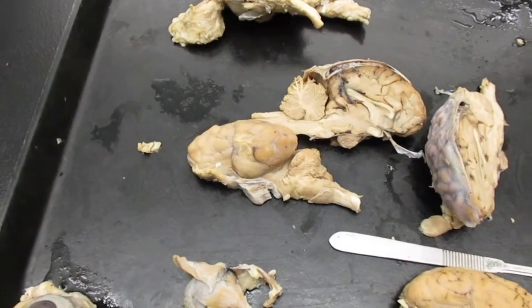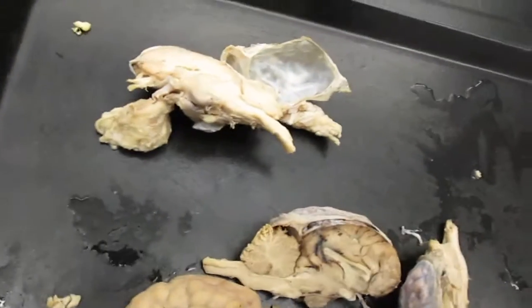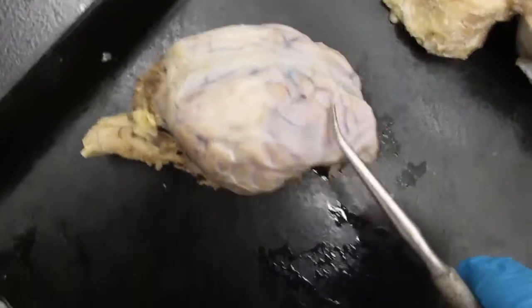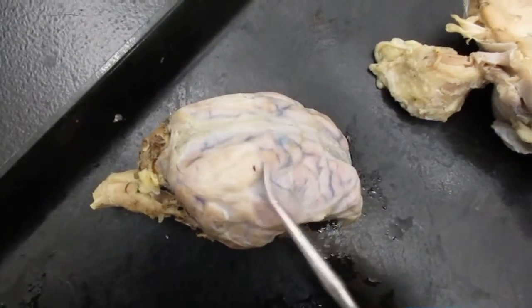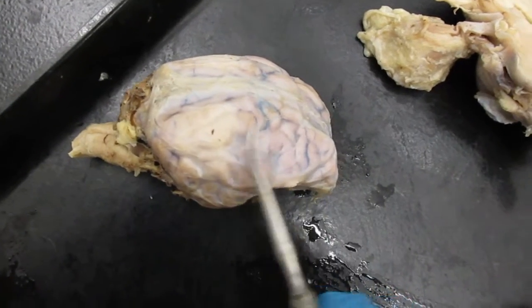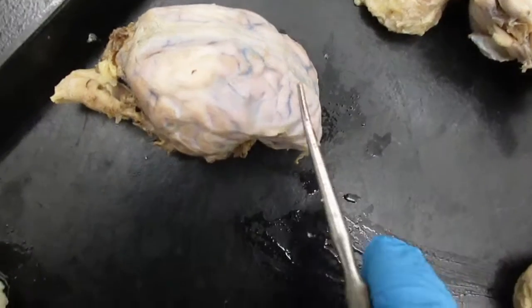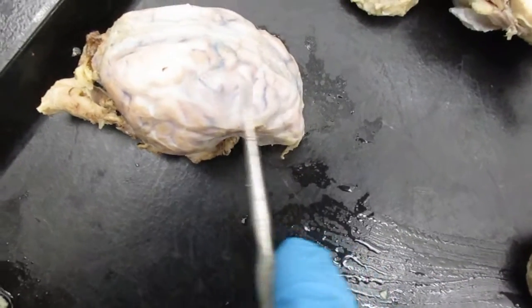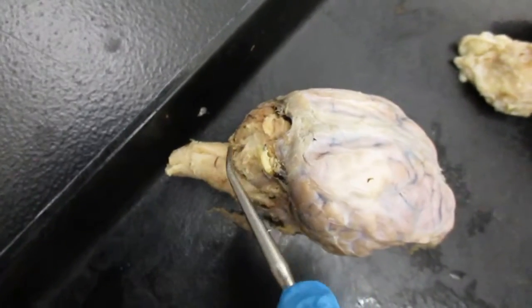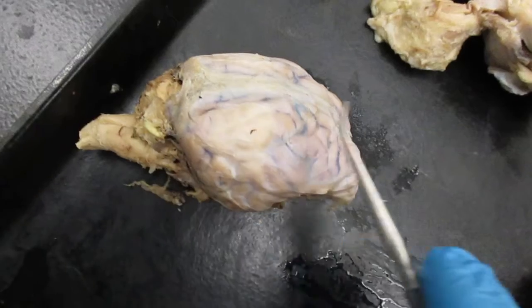Okay, I want to talk about the sheep brain dissection. The first one I want to talk about on the list would be the dura mater. It's white connective tissue right here. Very tough dura mater. Now, right here we have the cerebrum, and right here we have the cerebellum. So cerebrum, and then your cerebellum right there.